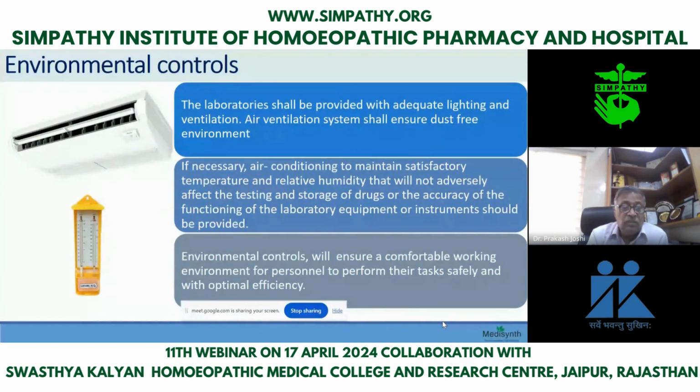And that is why this is shown for you, how to maintain the temperature, and you have to record it, whether the temperature and the humidity of the laboratory is the same throughout the day, throughout the week, throughout the month, or not. During working condition, when you are off, that is when you close the laboratory, then it is not required. But when you are working, when you are performing an experiment, then the temperature and humidity should always be the same. Because if there is a difference in temperature or humidity, the results vary. So that is why it is very important; we say environmental quality control.